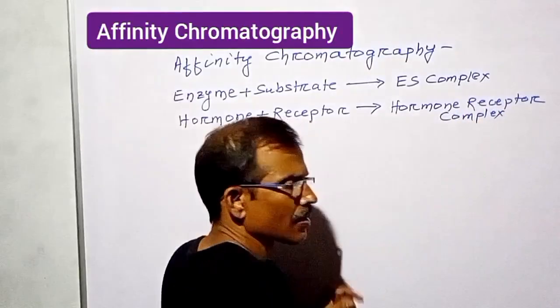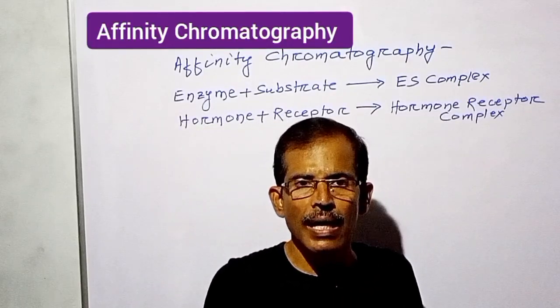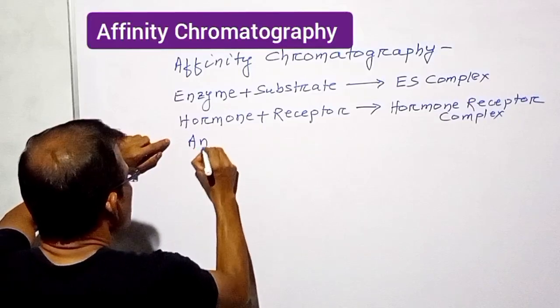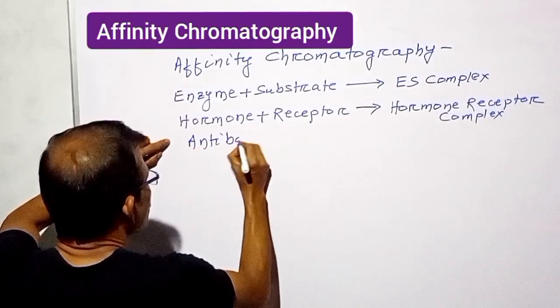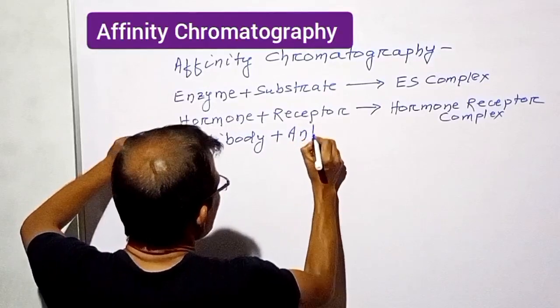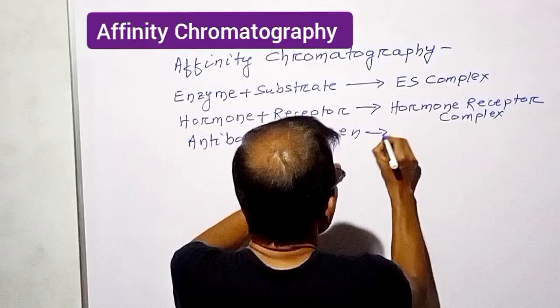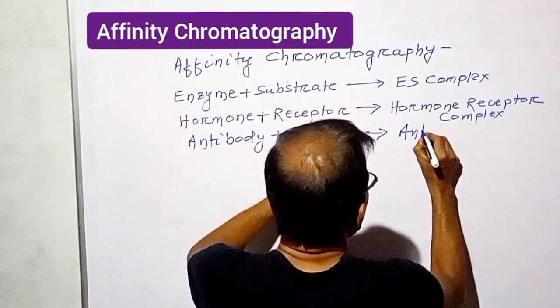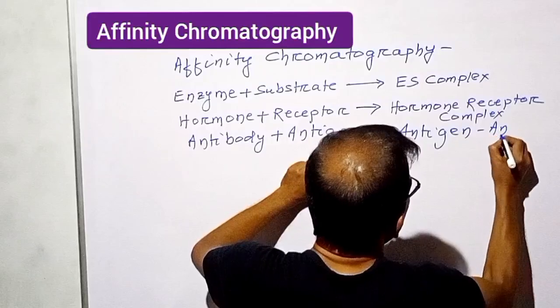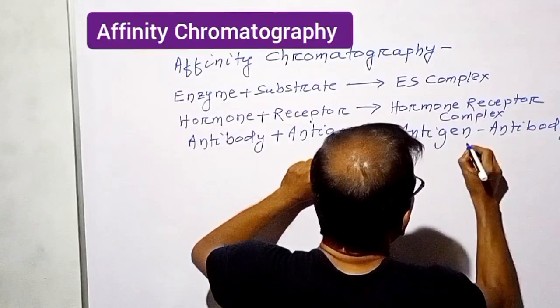Similar interaction also takes place between an antibody and an antigen that result in the formation of the antigen antibody complex.